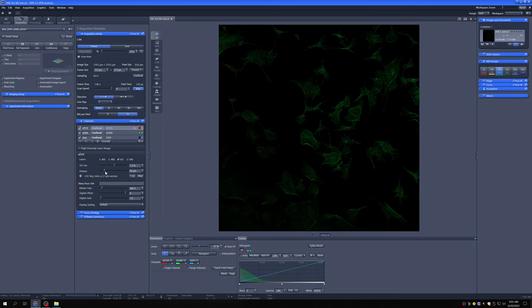And you can see that as I move this, if I make it bigger, the optical section is bigger, and the airy units are bigger. What we recommend is to make it one airy unit for your longest wavelength dye, and then to make sure that that value is the same for all the other ones, even if the airy units are not the same.